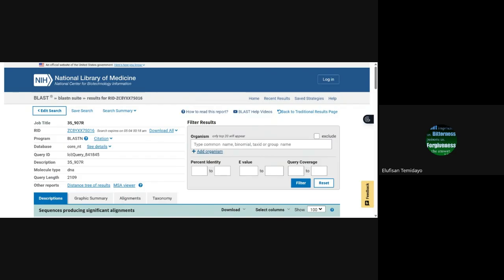That's where I will be explaining. That's my PowerPoint now. I'll be talking. I'm going to be moving around, but I just pray that we don't get confused as I move around. Before I move to Mega, I want us to see something in my PowerPoint again. So let's just go there. Now I'm moving. I want to share with us something in my PowerPoint, and I want to explain some things quickly.